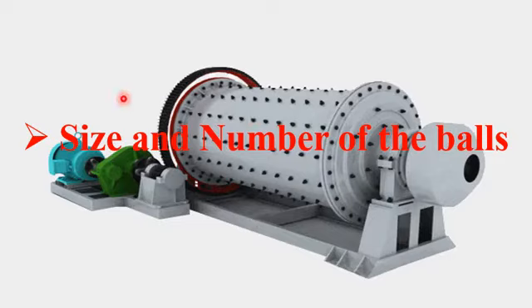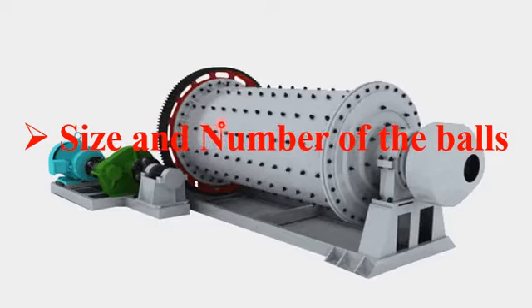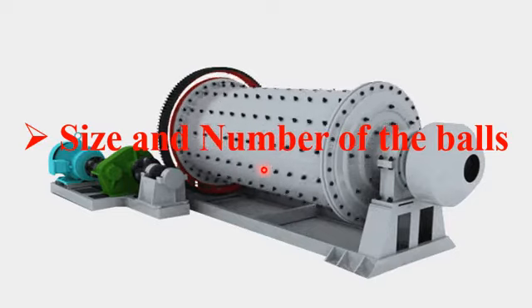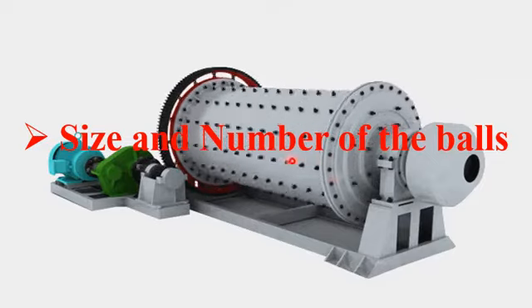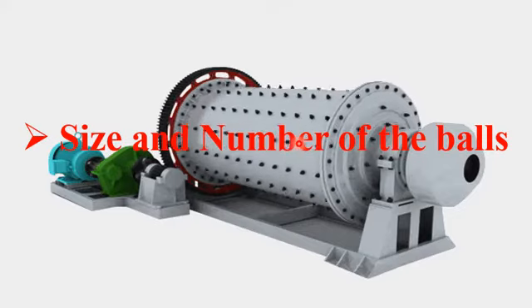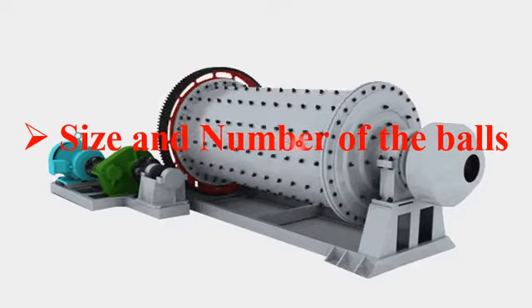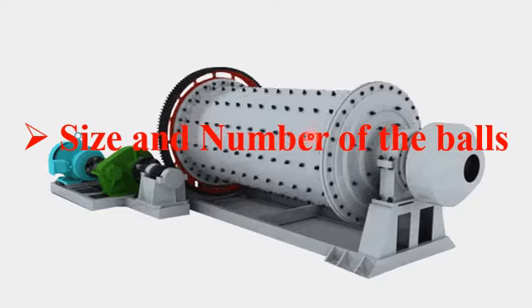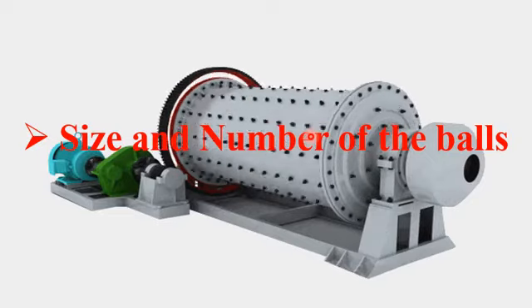It also depends on the nature of the ball milling drum. Usually the volume of balls used is somewhere around 30 to 50%. However, mostly the volume of balls used is in the range between 30 to 40%.